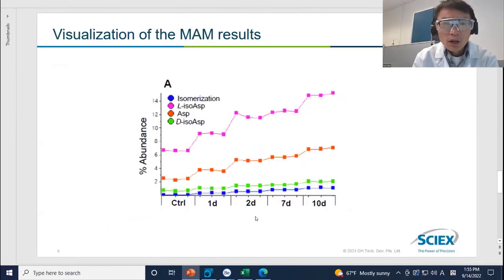And so after 10 days of heat stress, we can see our last trend, because the heat just promotes the deamidation. And so we are able to quantify. If we solely run CID, you can only see just one curve of the deamidation. But using the EAD, we can tell how the isoAsp or D isomerization changes. Okay.